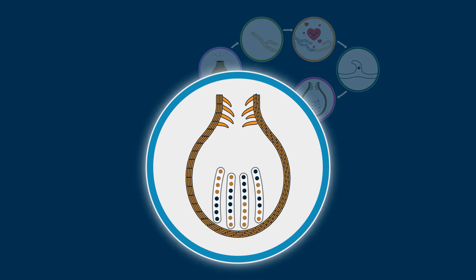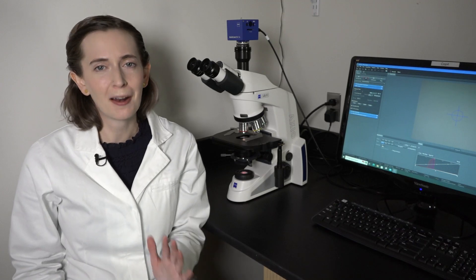The spores are what we'll observe today because they'll either be black or tan like their parents, and their arrangement inside of each ascus is key to understanding recombination during meiosis. Let's start the experiment and I'll show you what I mean.